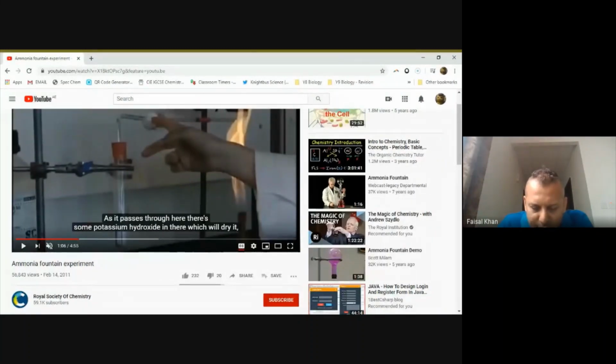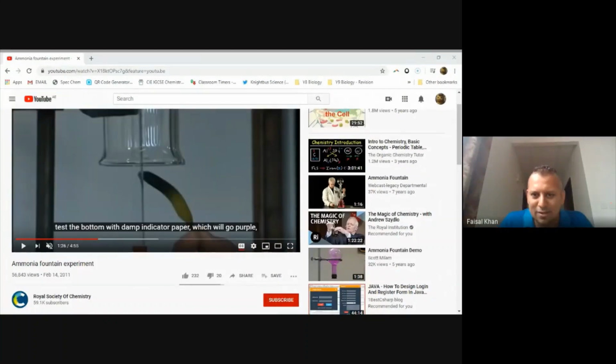So when you heat that, you'll also get water evaporating as well. So you've got ammonia gas coming out, and you've got water coming out. So the potassium hydroxide removes the water, so that you just have a jet of ammonia coming through. And just go back to the presentation.